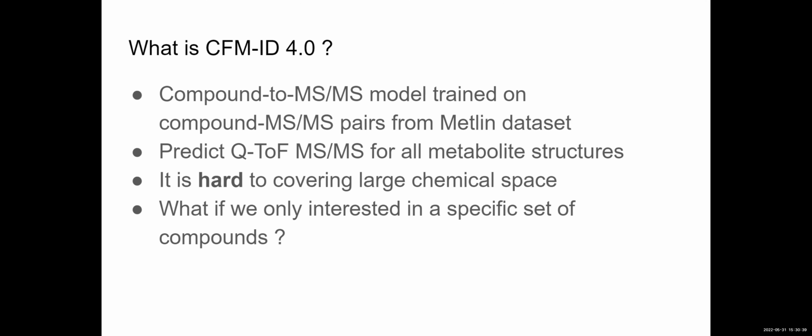What we have learned is that it's very hard to cover this very complicated and large chemical space consisting of all the metabolites. Later last year, a group from Denmark approached us, asking whether we could build domain-specific models to cover a specific set of compounds, because they are a forensic lab really interested in illegal drugs.